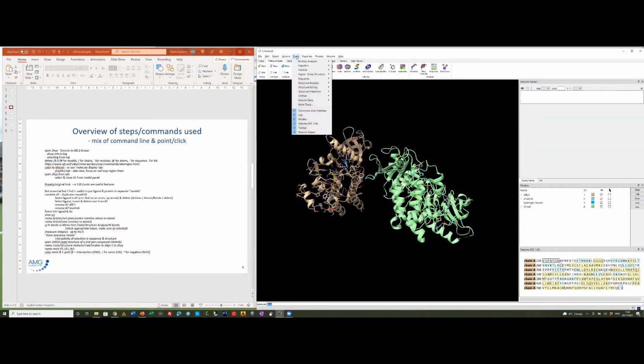So we can use the command, where is it? Yeah, structure analysis, Matchmaker.